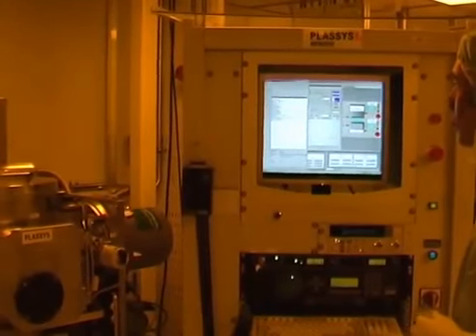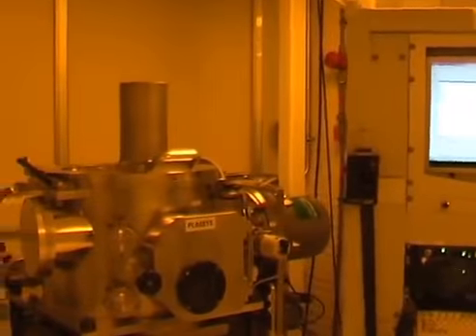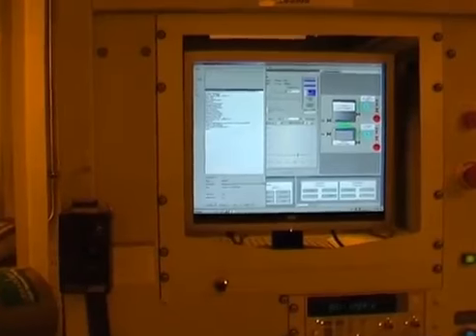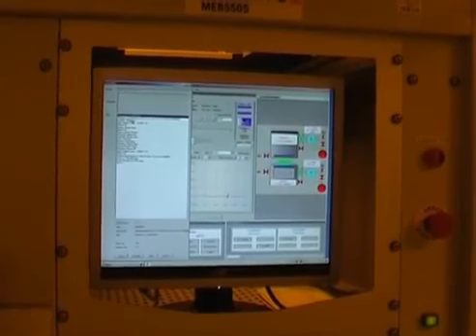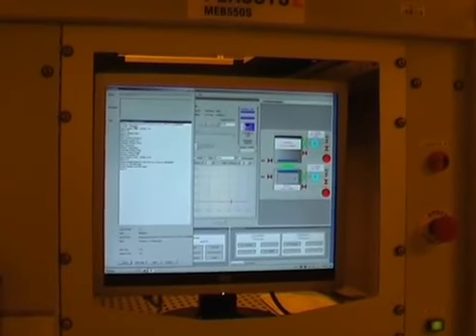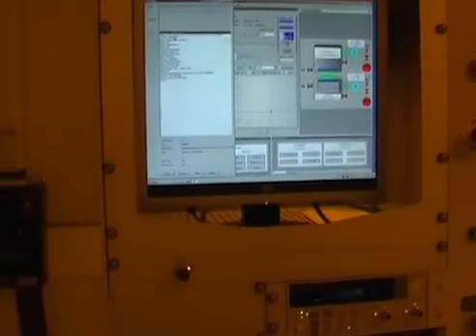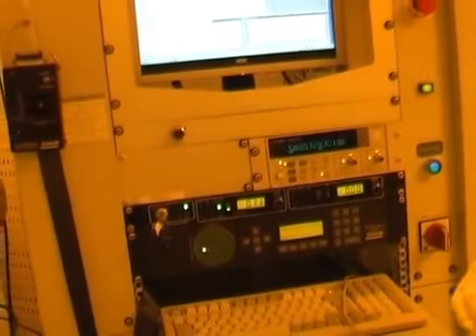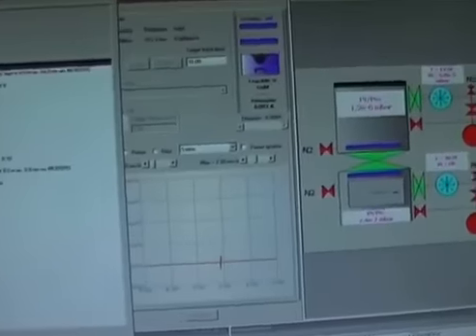And after the selection of the crucible, the electron beam gun is going to be ramped to a value of current that has been calibrated to give a certain deposition rate for the metal that we're using, and once the rate is controlled to be at a certain value, the shutter will open and will actually start the deposition on our sample.